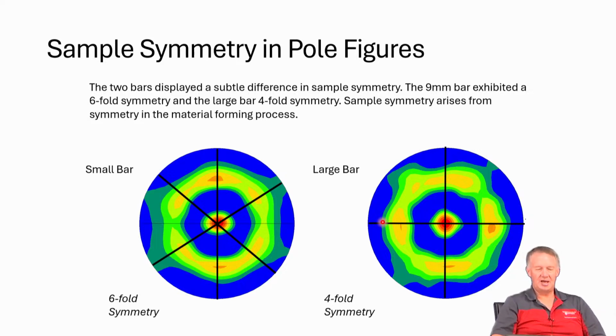All right, so does it matter if we enforce symmetries? Yes, because the way that we calculate, the way we enforce the functions is dependent on whether or not we do the sample symmetries. So we look at our symmetries, and do we have these symmetries in the specimen or not? In this case, there's no sample symmetry that's been enforced. Do we believe that it should be enforced? Do we have a 6-fold symmetry on this, or do we have a 4-fold symmetry on this?